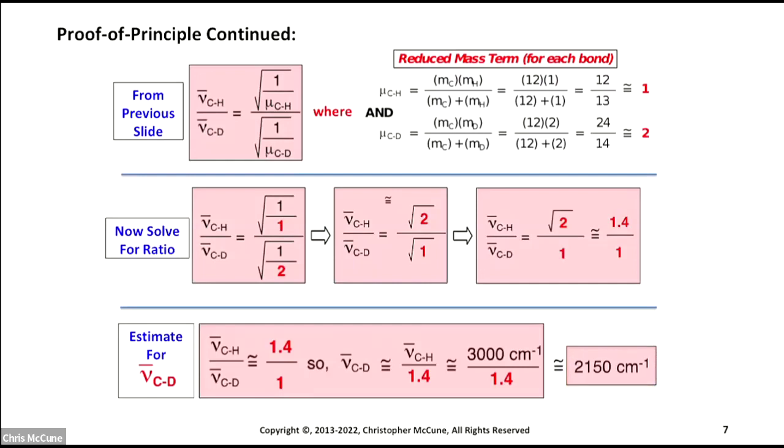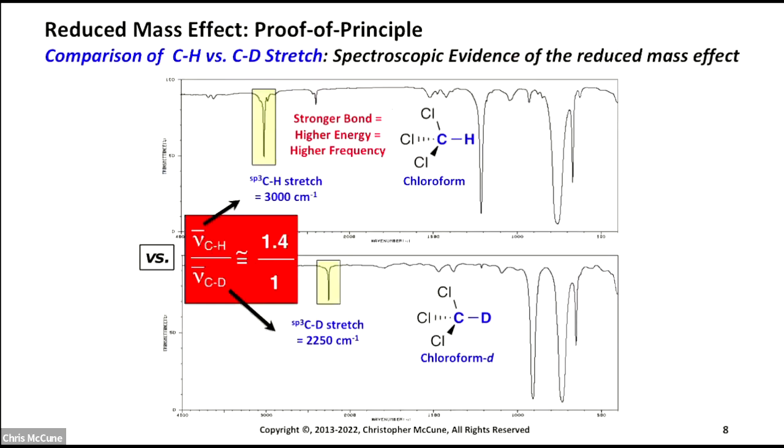But more importantly here, the difference in these numbers is pretty significant. And that's just by changing the mass of the lightest atom by 1. So there's a big effect. The light atom dominates the term. Here are the IRs that we can look at. I've chosen to use chloroform because there's just a CH stretch that we'd show in the non-fingerprint region.